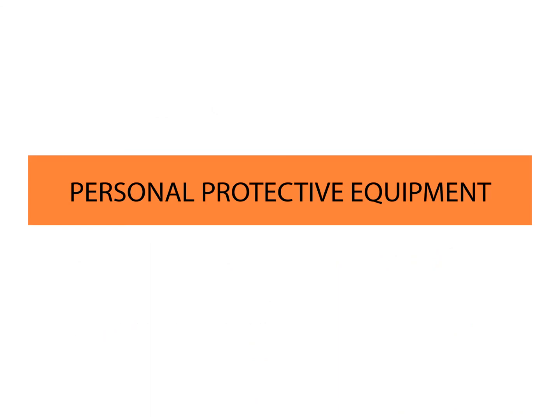Let's talk about personal protective equipment or PPE. Know the appropriate PPE for the activity that you are supposed to do. Some laboratories may have stricter PPE requirements, especially for specific activities. Ask your instructor, supervisor, or laboratory faculty in charge about it.